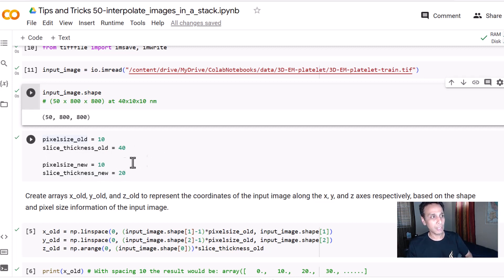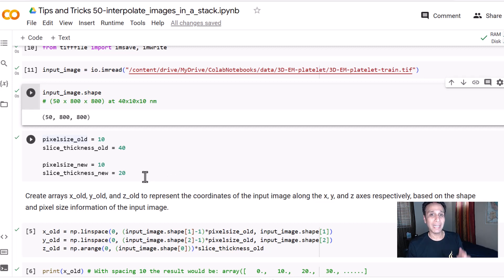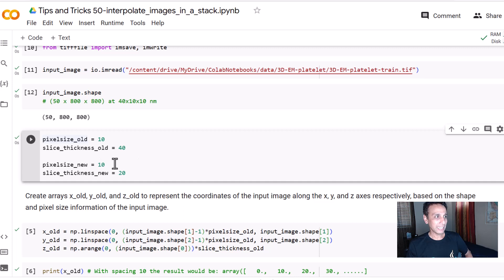If you want a fully isotropic volume, go ahead and set it to 10, but Google Colab may crash because that stores too much in RAM. If you have higher or paid Google Colab, or if you're doing this on your own system, you'll probably have better luck.